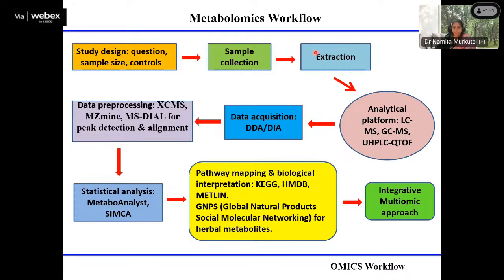But after extraction of the metabolome, a particular derivatization step is needed when you are using gas chromatography. But sometimes in LCMS also a derivatization step is needed if your sample has oil based compounds or alkaloids. This derivatization is done by adding some chemical compounds, such as acetylation or silylation.